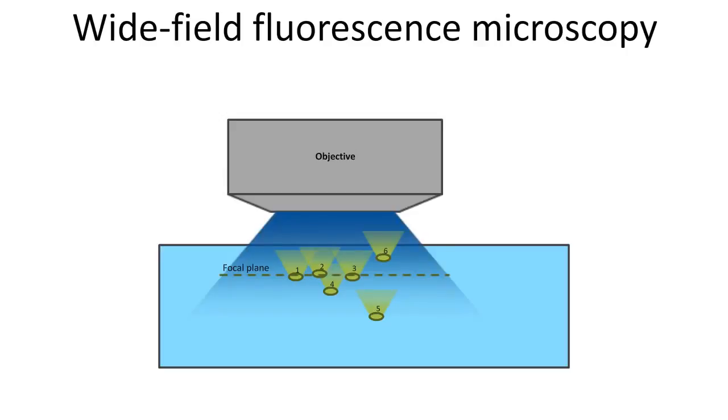The technique has several drawbacks compared to, for example, two-photon microscopy, in the sense that out-of-focus light is also imaged, and there's a great deal of scattering. However, with the new techniques that we've developed, the benefits far outweigh the limitations, in the sense that you can record in freely behaving animals with really great temporal resolution and spatial resolution, and we can record from identified cells.